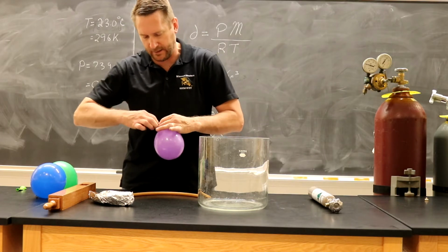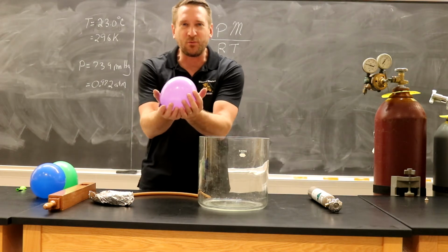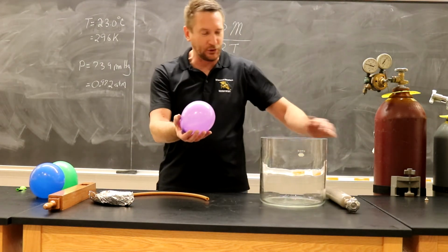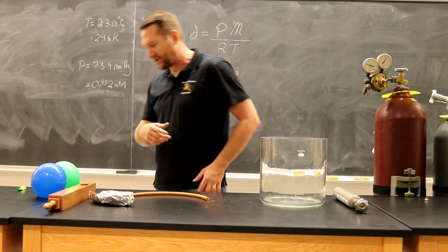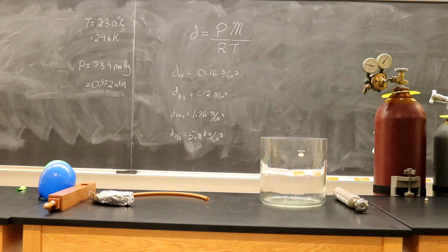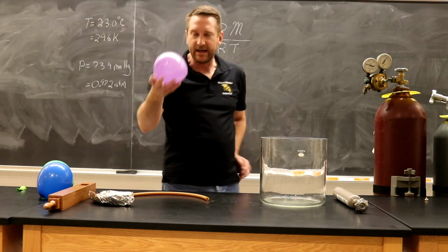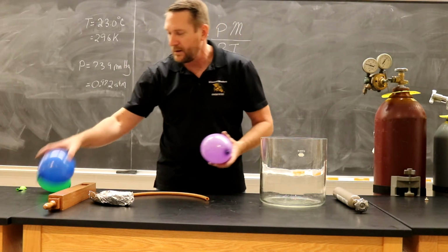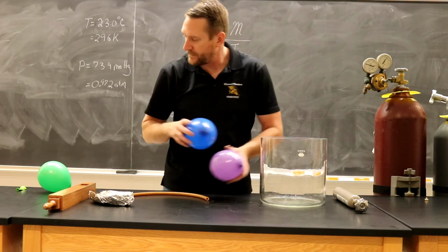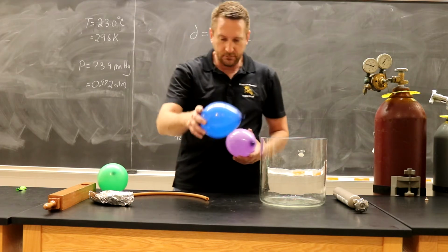And we're going to set it on the counter. There we go. I'll tell you, this balloon, it's heavy. It's weird to feel it, that a balloon would have so much mass associated with it. But you can see it drops like a brick. Whoop, I have to go retrieve my balloon now. So this thing has quite a lot of mass because of the density of that sulfur hexafluoride. So sulfur hexafluoride, my carbon dioxide, and then my dry nitrogen.